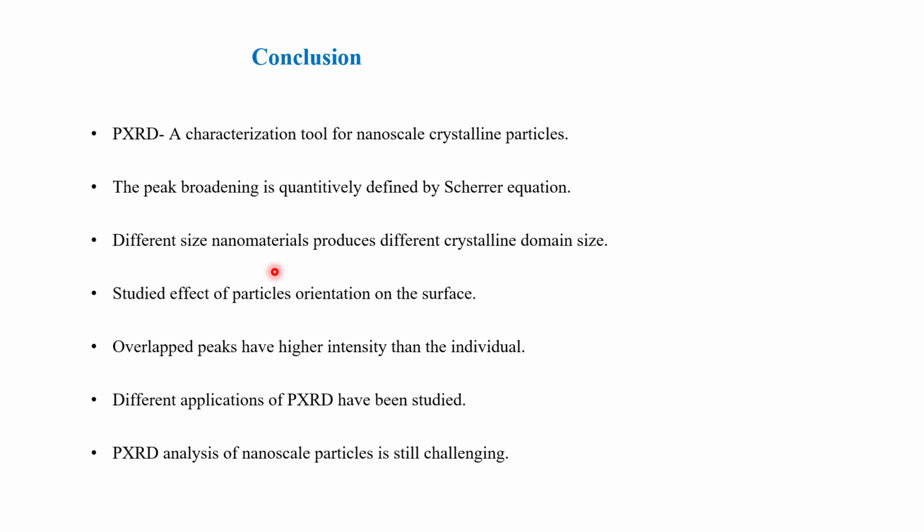We also discussed the overlapping peaks that we get when we have mixtures of different size crystals. We have discussed different applications of PXRD, and PXRD analysis of the nanoscale is still challenging, so we have to work on it more. Profile fitting has some good options to read the broad XRD peaks of nanostructural materials. That's all. Thank you.